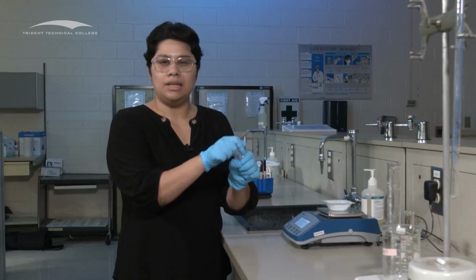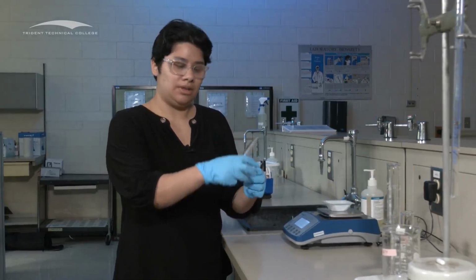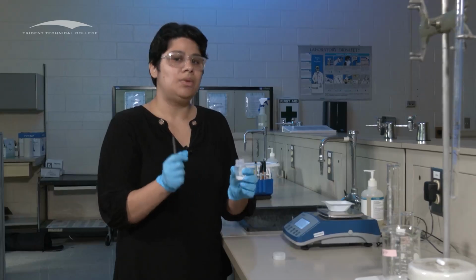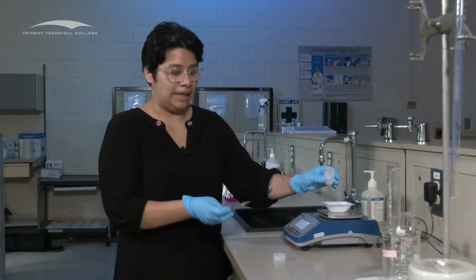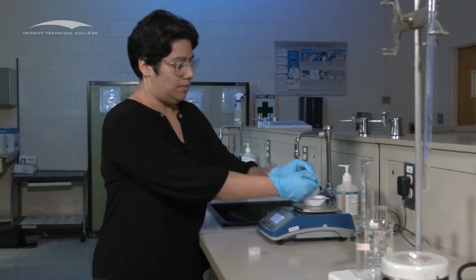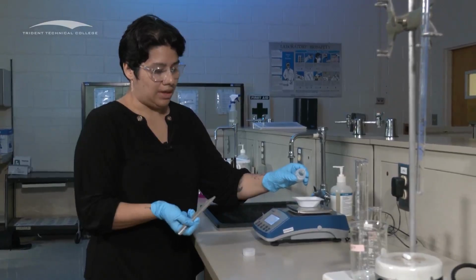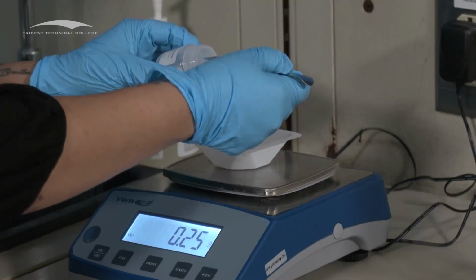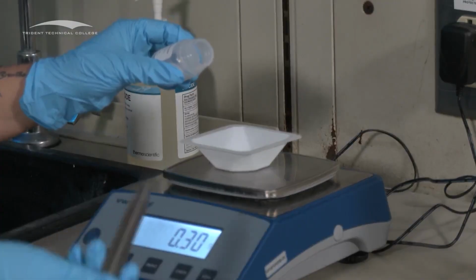So you're gonna need either 0.5 grams or 1 gram, depending on which version of the lab you are doing. And you don't need exactly that, but you wanna get as close as you can. So I don't wanna eyeball it, you shouldn't be just dumping it in. So what you're gonna do is grab a little, and then pour slowly until you get what you want. So I got 0.26, and let's add 1.5. Then I just want a little bit, and you would do a little bit at a time. The idea is not to waste any.